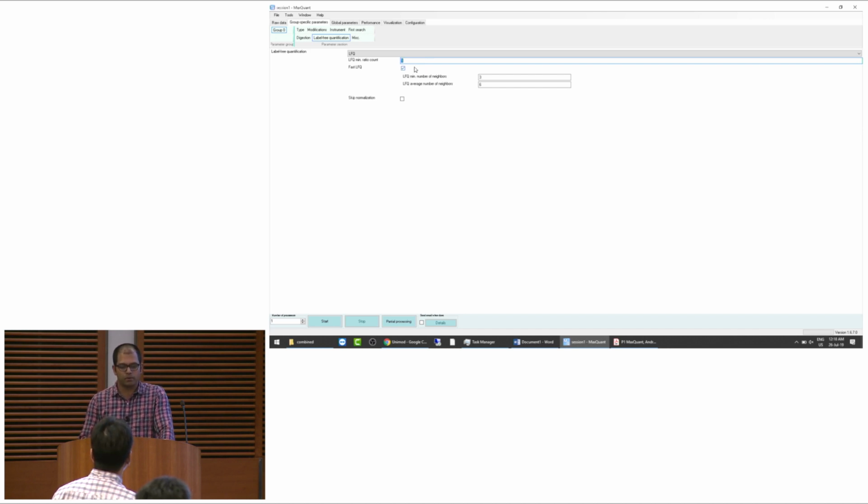but here you actually cannot post process, you cannot filter them. I don't know, is there any way to filter them? No, you cannot filter them. So if you are interested in having a ratio count of 2, then you actually have to reprocess the data. Right. So in the ratio counts for the SILAC, I mentioned that you can say minimum ratio count is 1. And then if you want later, you can filter the data by saying ratio count 2, using that criteria. But here, there is no way to figure out what was the ratio count in the output tables. So if you want ratio count 2, you have to reprocess the data.